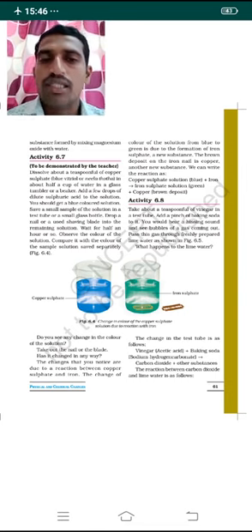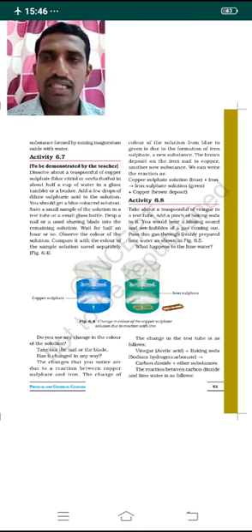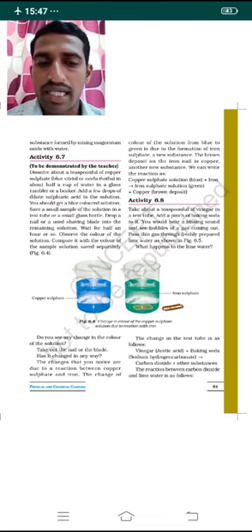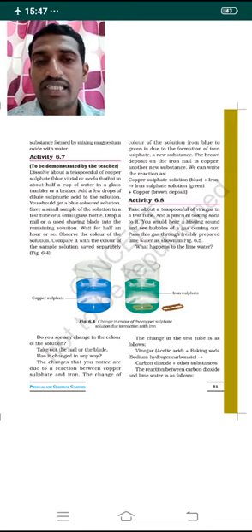Remember, here we have taken vinegar, which we call acetic acid, plus baking soda, which is sodium hydrogen carbonate, a base. When acid and base are added together, there is a formation of carbon dioxide gas. Keep it in mind: the bubbles of gas coming out of the test tube are carbon dioxide gas. There is a formation of a new substance here, and along with that one more substance is formed. The reaction between carbon dioxide and lime water is shown as follows.